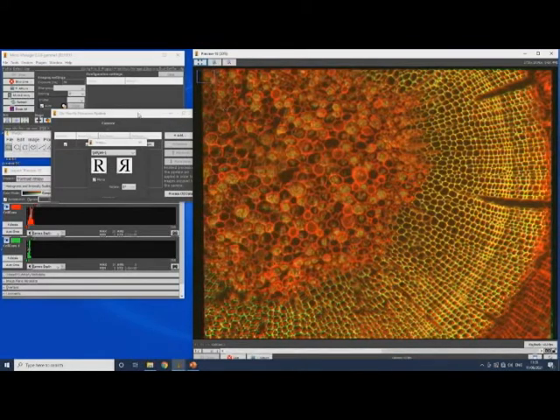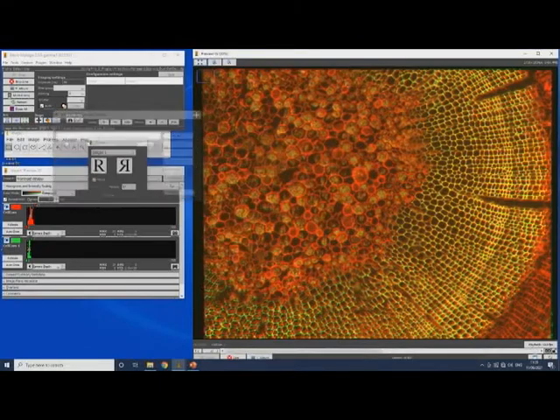Which looks like it's set up there. Yeah, it's just called Image Flipper, isn't it? Yeah, Image Flipper, and now you've got it in the correct orientation. Very nice and simple. So that's the twin cam.